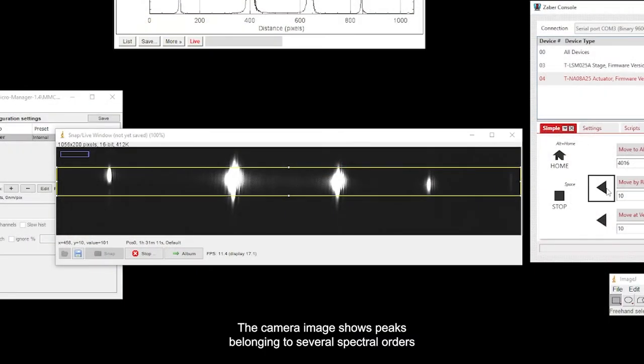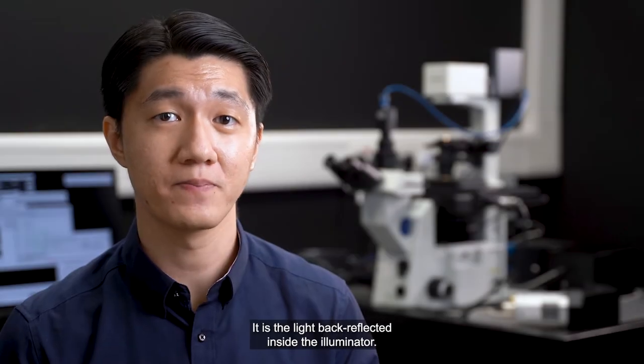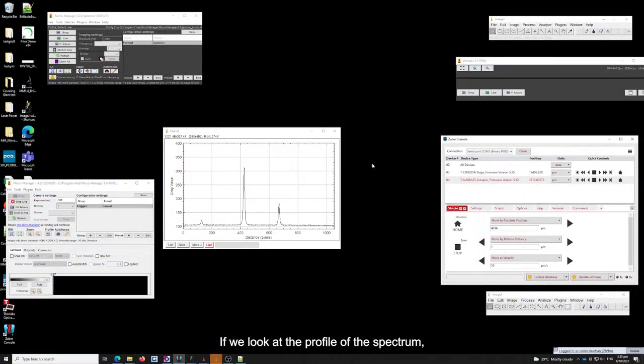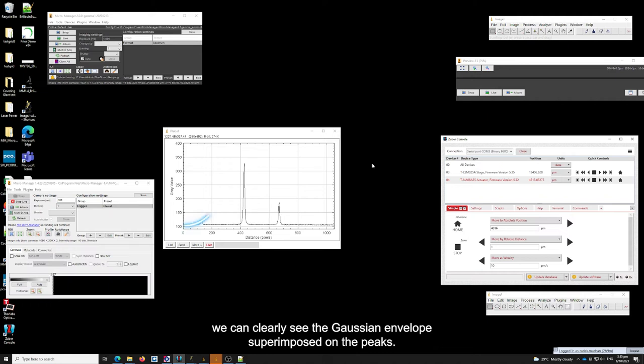The camera image shows peaks belonging to several spectral orders, with a Gaussian envelope superimposed. The spectrum we see consists of Rayleigh peaks only. It's the light back-reflected inside the illuminator. If we look at the profile of the spectrum, we can clearly see the Gaussian envelope superimposed on the peaks.